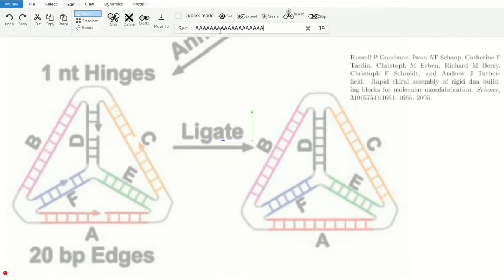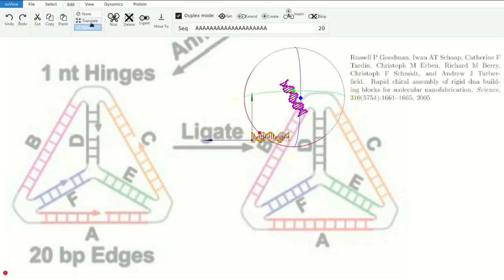We can input the correct sequence if we want to, but it's easier to set a sequence afterwards. Let's create one like this, and then we can copy and paste. Ctrl-C, Ctrl-V, select everything with Ctrl-A, and rotate. You can just use copy-paste and things like this. R is rotate, but you can find it there.